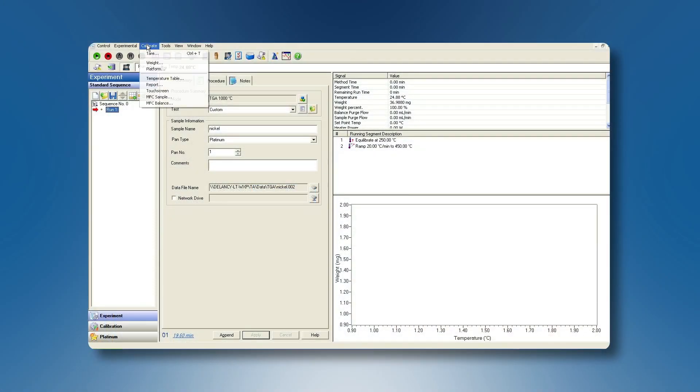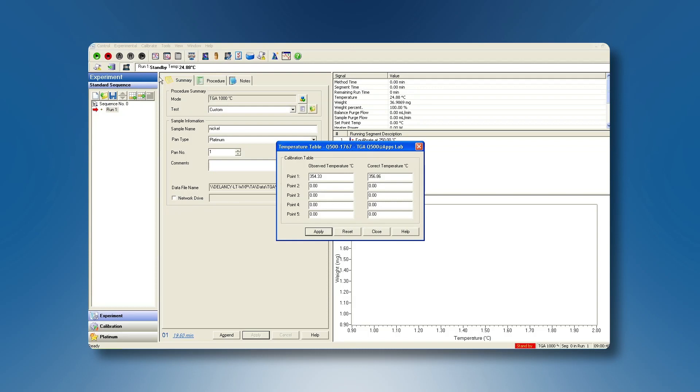First, select calibrate temperature table from the TGA menu. Reset all previous calibration data to zero and apply before conducting a new calibration experiment.